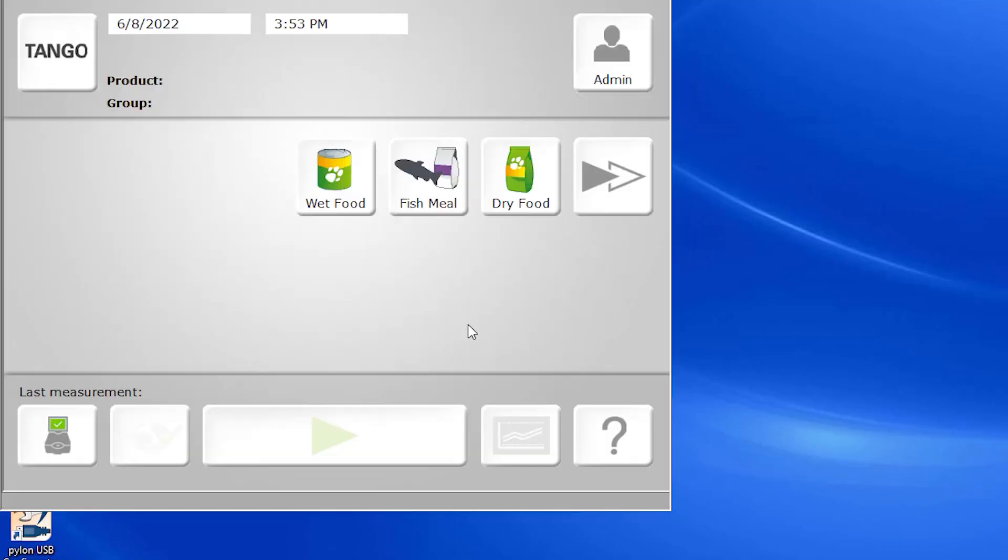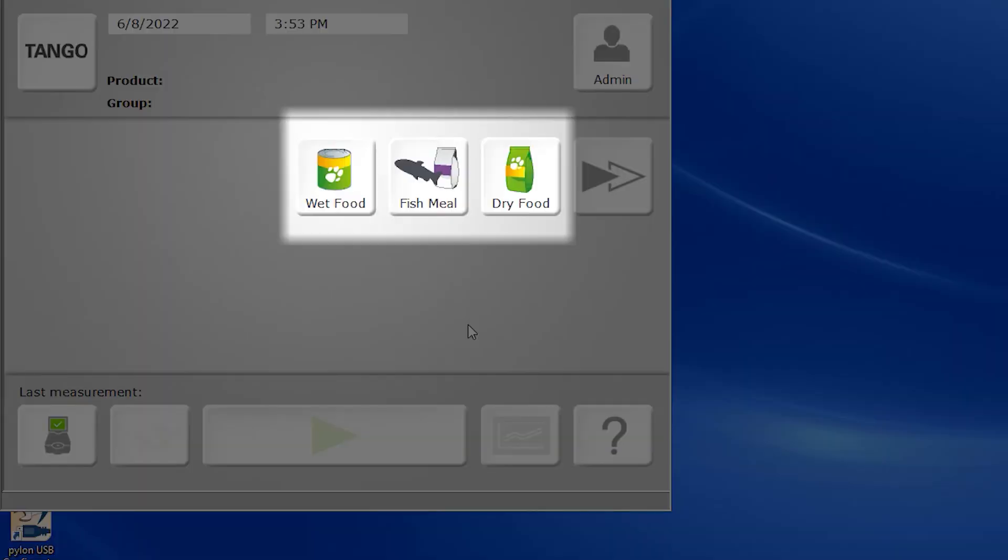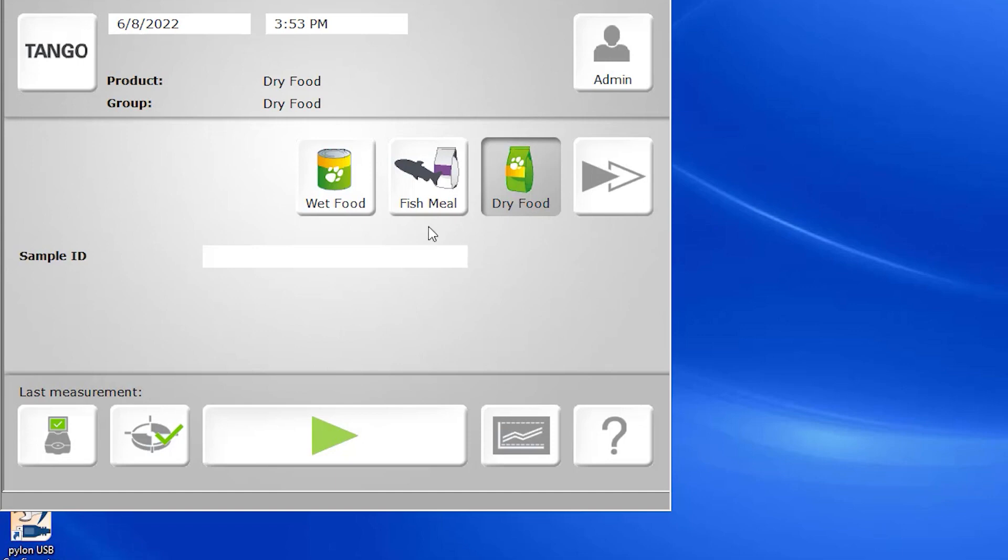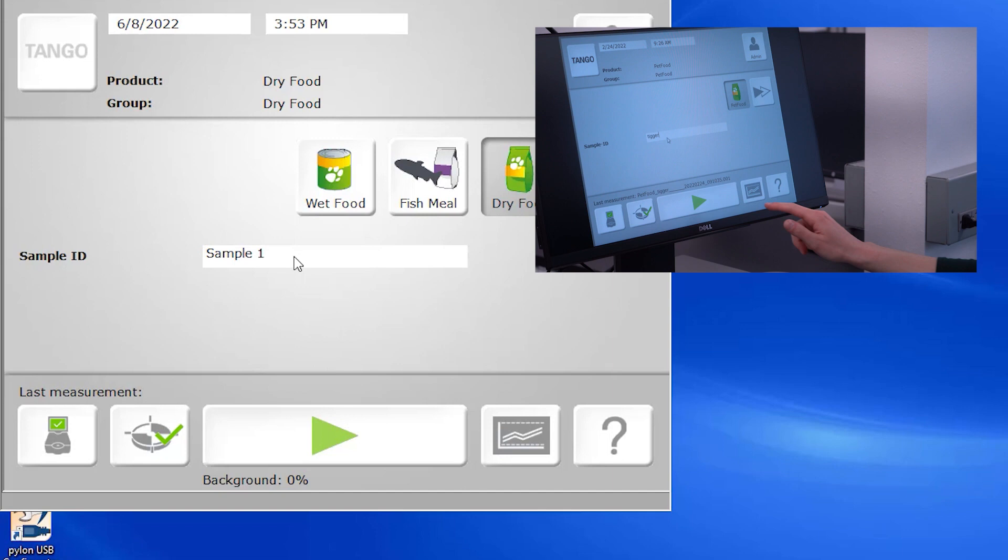As we navigate back to the main screen, we see that it's displaying different products, either up to six products that we've selected as favorites or the products that we've most recently run. When we're ready to scan a sample, we select the appropriate product, input the identifiers for the sample, and simply hit go.